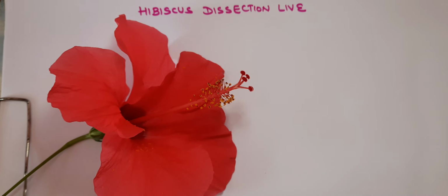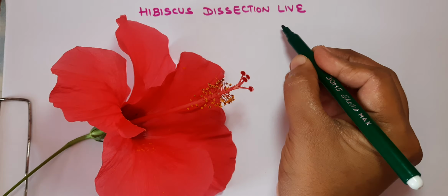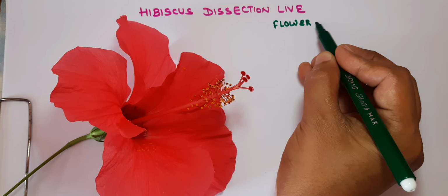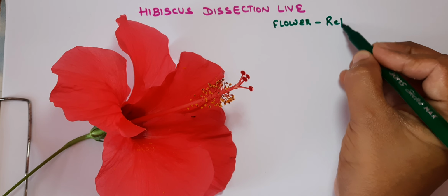Hello everyone. So today we are going to talk about the dissection of the hibiscus flower. Okay, but before that I will just give you a glimpse. So what is a flower? A flower is basically the reproductive structure.